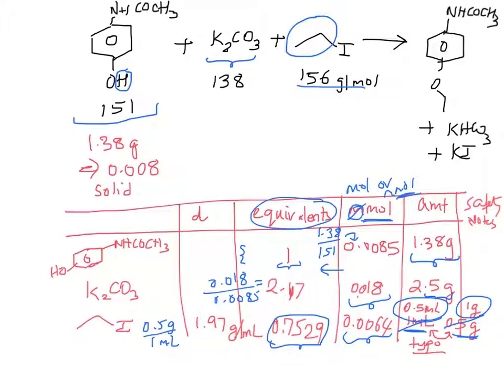Do you think that our ethyl iodide is enough for this reaction to take place? Obviously not, right? So you will have some unreacted acetanilide which will stay behind in your reaction mix, and you will have to figure a way out to remove that.